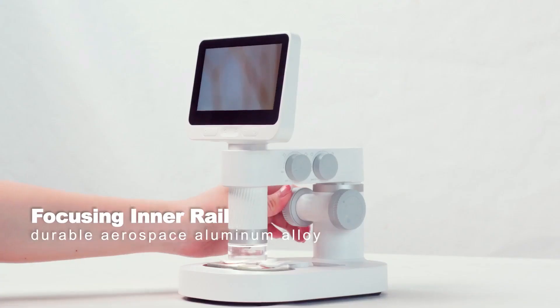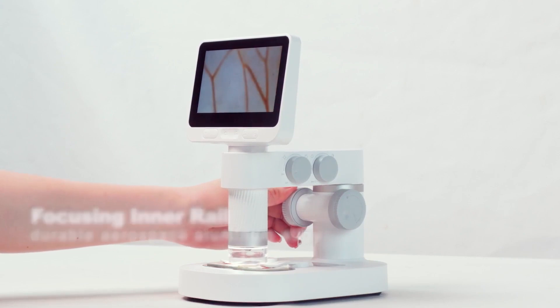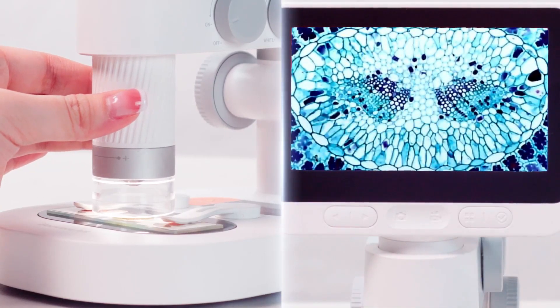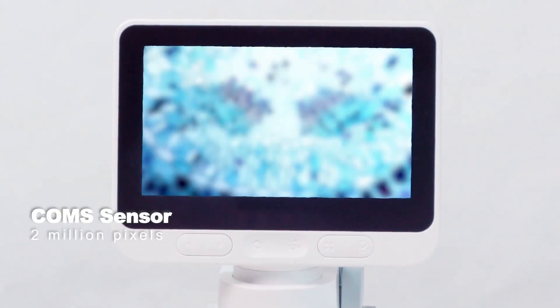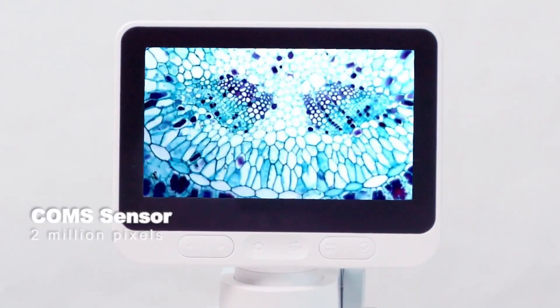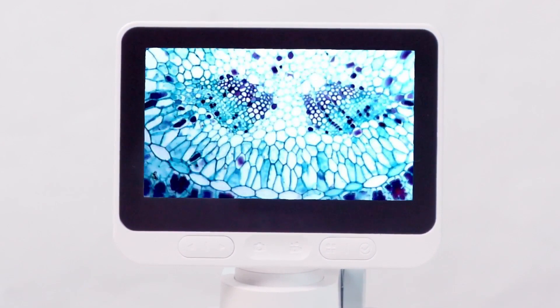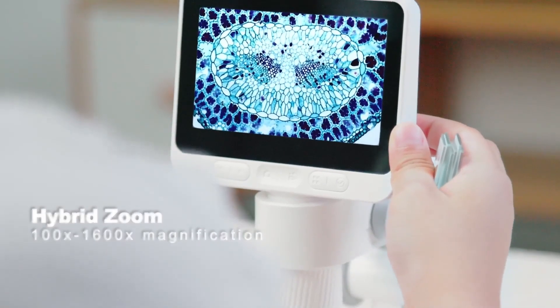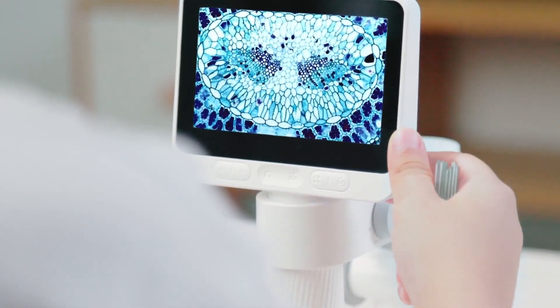Aviation-grade aluminum alloy focusing rail gives you a smooth and precise focusing experience. The 2 million pixel image sensor delivers high definition 1080p videos and images. Hybrid zoom capability allows for magnification from 100x to 1600x.